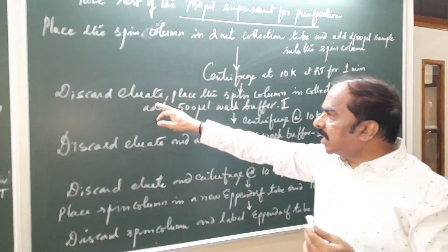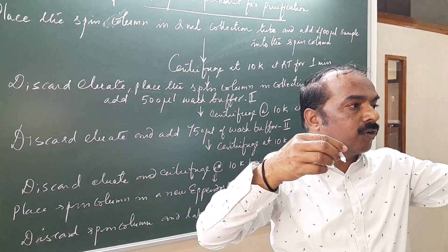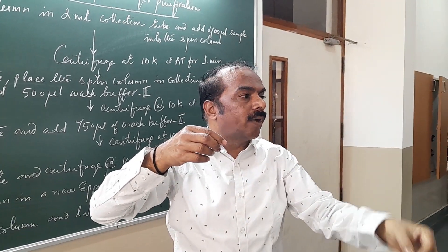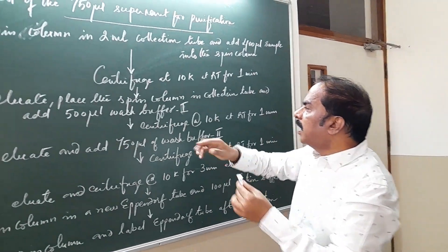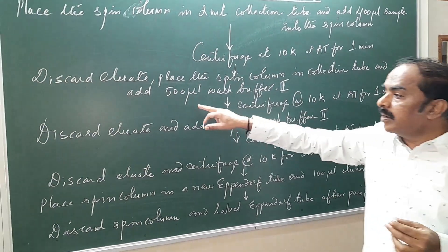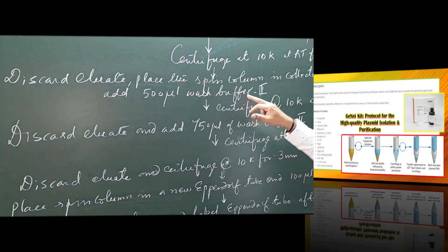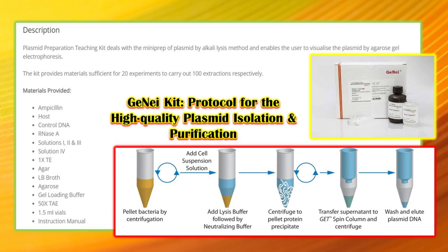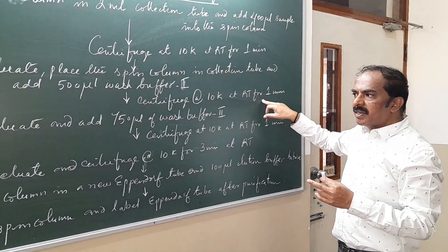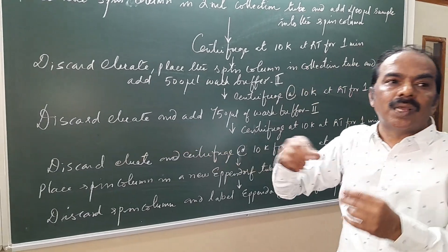Next, discard the eluate. The eluate is collected in the collection tube, which we discard by removing the solution. Then place the spin column again in the collection tube, add 500 µL of wash buffer 1 from the Genie kit, and centrifuge again at 10,000 rpm at room temperature for 1 minute. Discard the eluate again — this is the washing and purification step.